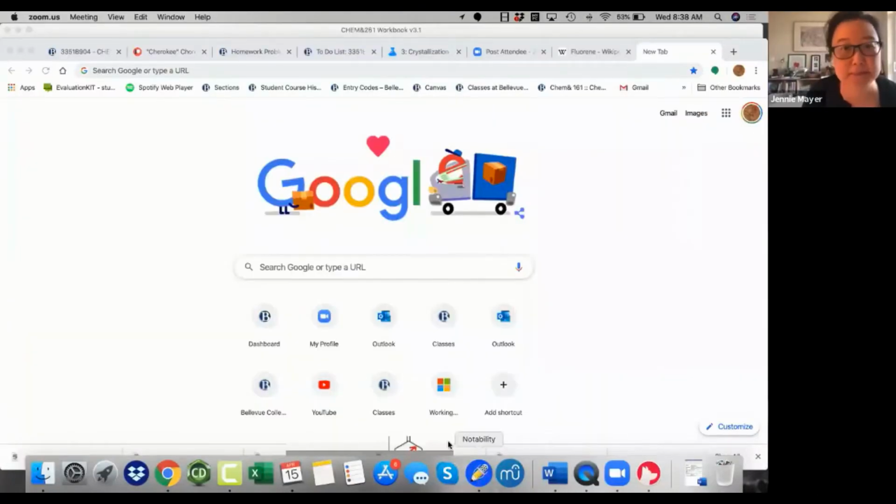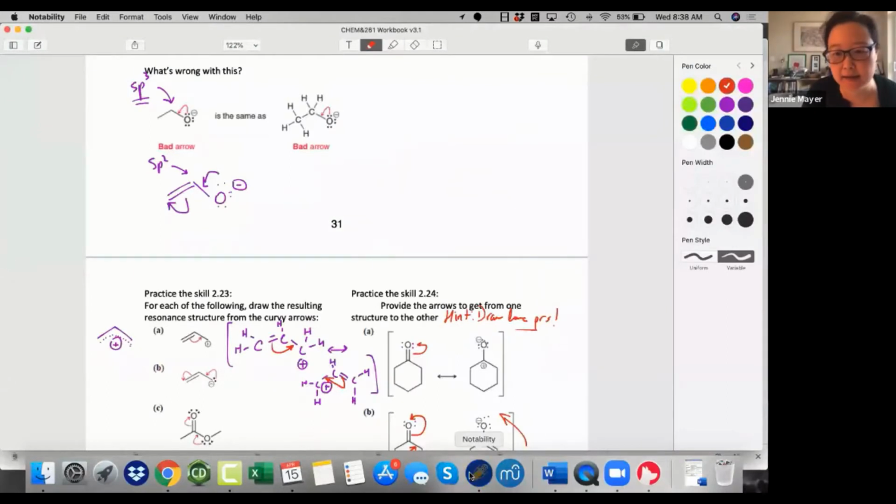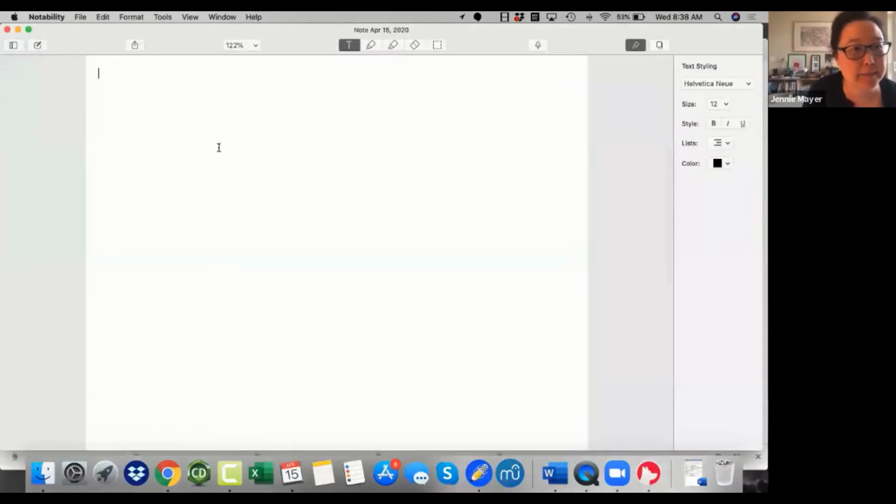So let's start with a little bit of notes here and the basic idea of experiment 55, which relies on understanding how to purify samples. So I'm going to share my screen when I can find that. And then we're going to look at some ideas here.